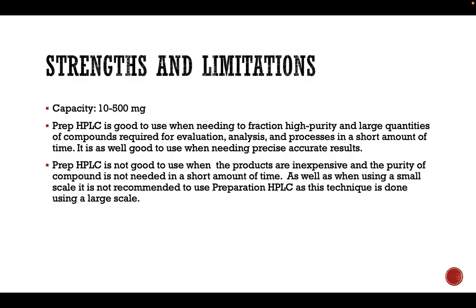Now, one thing to note, it's not good to use a preparative HPLC when the products are inexpensive, the compound is not needed in a short amount of time, and as well when using a small scale. Preparative HPLC is a technique that's usually done on a larger scale, so it's not ideal to use when you're using a smaller scale.